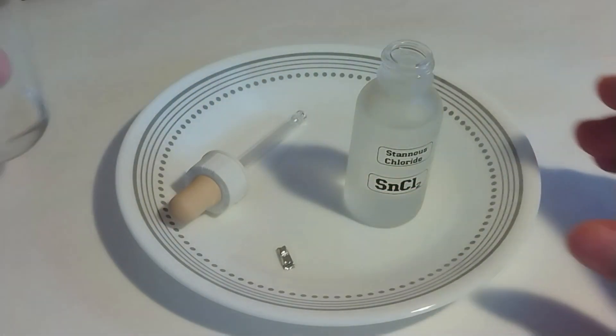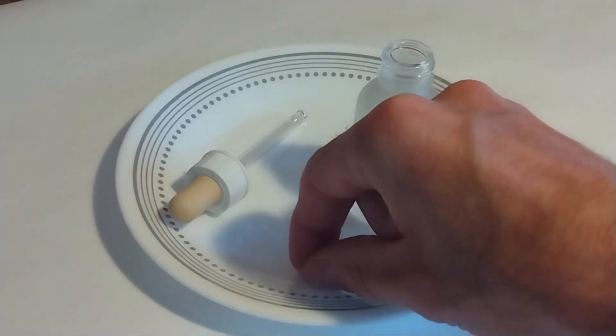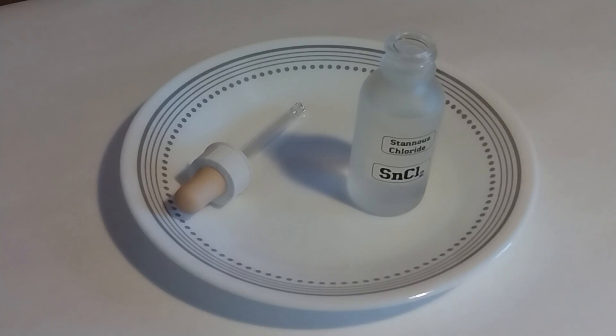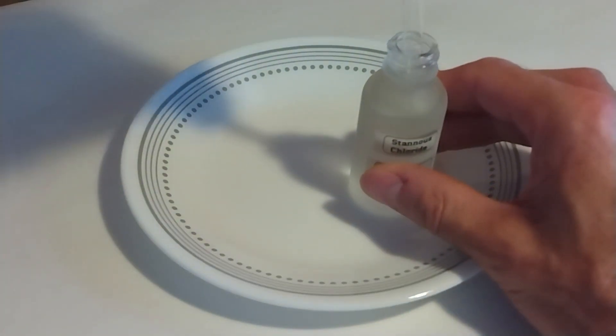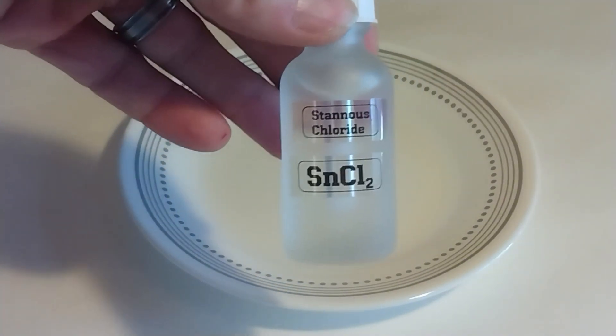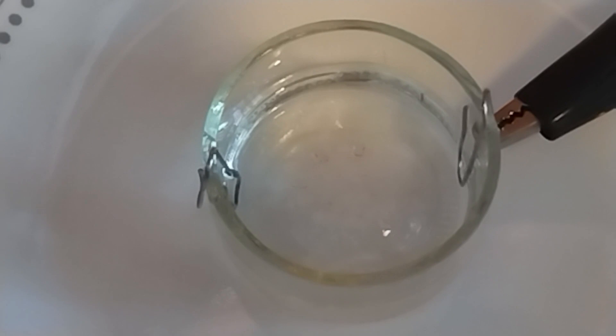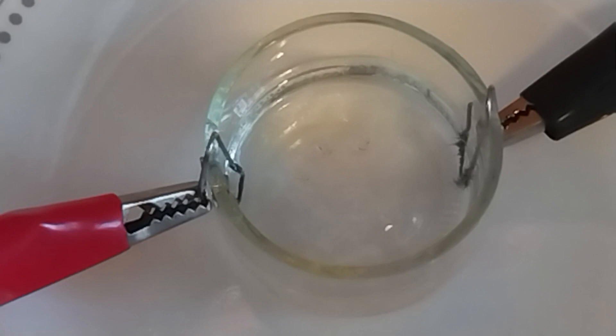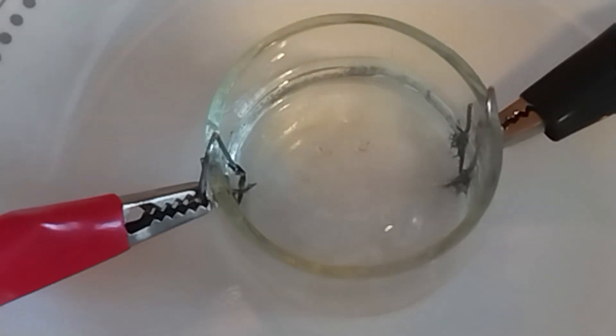And that's it — our stannous chloride is ready. It is recommended to add a piece of tin into the container in order to extend the shelf life of the solution. Let us check that what we have is really stannous chloride. We should be able to form some pure tin crystals by electrolyzing the solution. Right now I'm applying 9 volts and you can see those crystals growing at the cathode — this is pure tin.